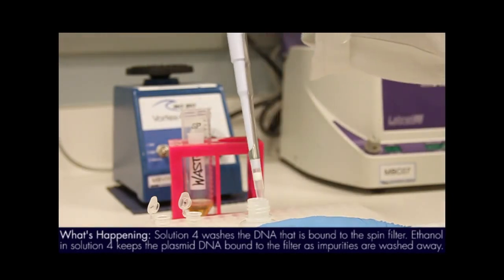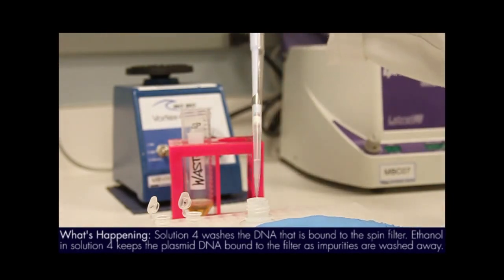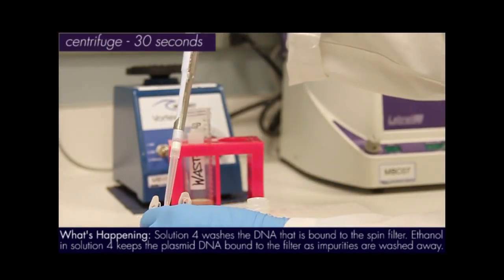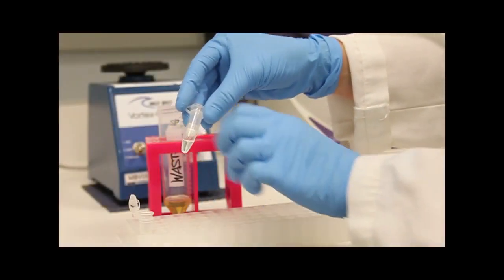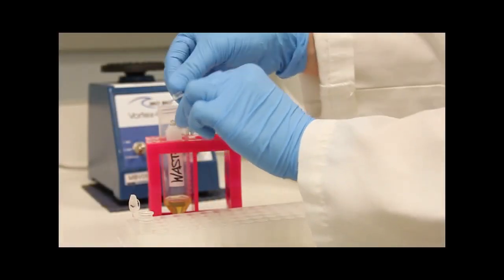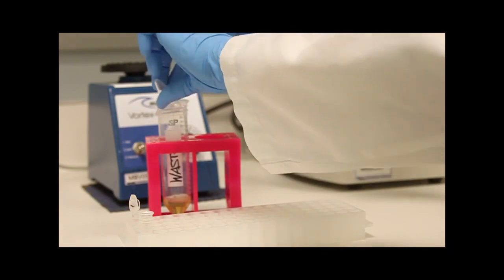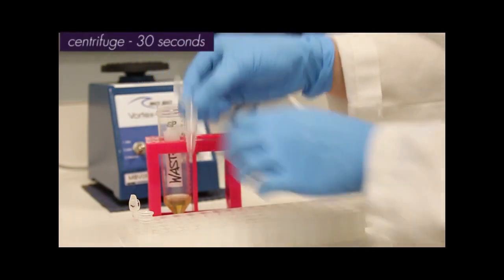Now we will add solution 4 to the spin filter to wash the membrane and centrifuge at 16,000 times G for 30 seconds. Discard flow through liquid from the 2 mil collection tube and centrifuge again for 30 seconds to dry the membrane.